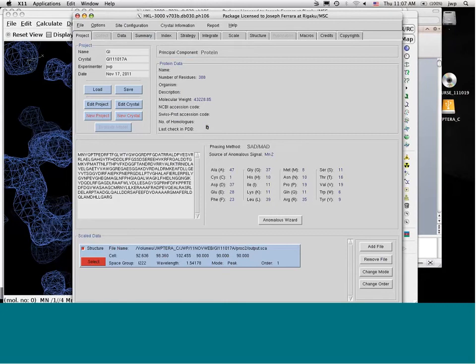So what you might do to help phasing, and I didn't do this here, is to go back and complete the anomalous substructure by looking at anomalous difference Fouriers and plugging it in. I know that Randy Read has his Phaser package now through the CCP4 interface, which goes back and looks at the log likelihood gradient map and will look for more sites than SHELXD found, fill them in and do phasing that way.